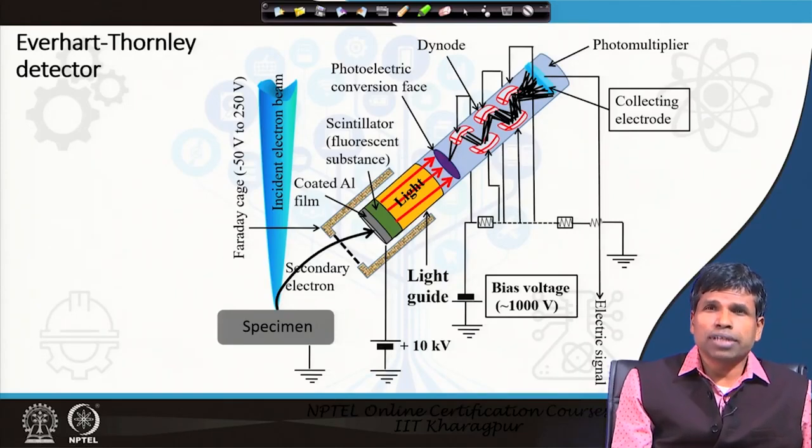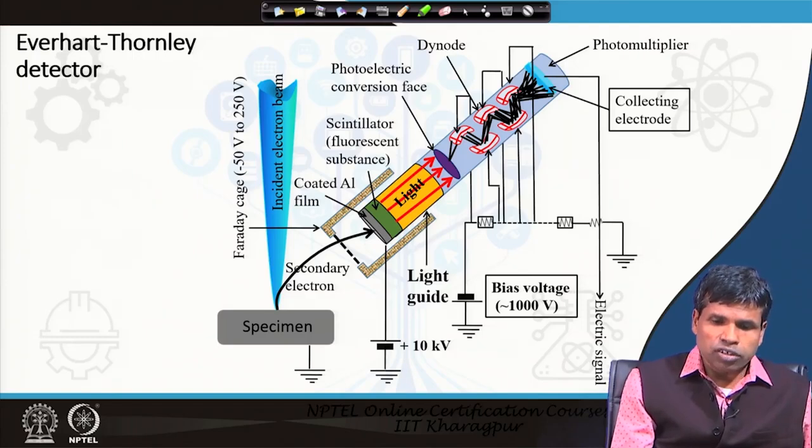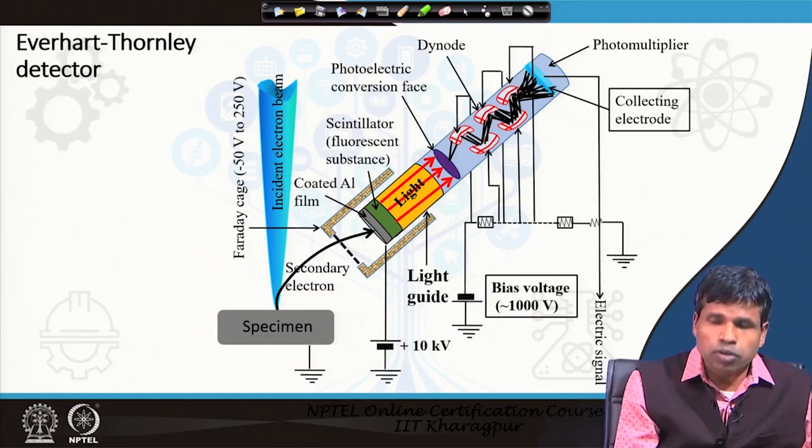There are two scientists who developed the detector for the SEM, and it bears their name, Everhart-Thornley. These are the scientists Thomas Everhart and Richard Thornley, who developed the detector in the 1960s, and therefore it is called the ET detector, which efficiently detects secondary and backscattered electrons with little noise and with high robustness. After the 1960s, this discovery of an efficient detector increased the use of the scanning electron microscope in the scientific community. So, we are going to discuss this Everhart-Thornley detector in more detail now.